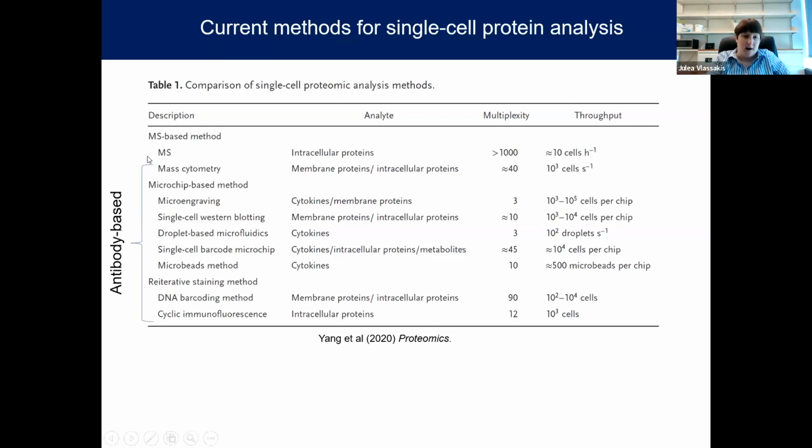So the vast majority of these single cell protein measurements are antibody based for their readout. A small proportion are mass spec based. And so the antibody-based assays are what I'll focus on in my presentation today.